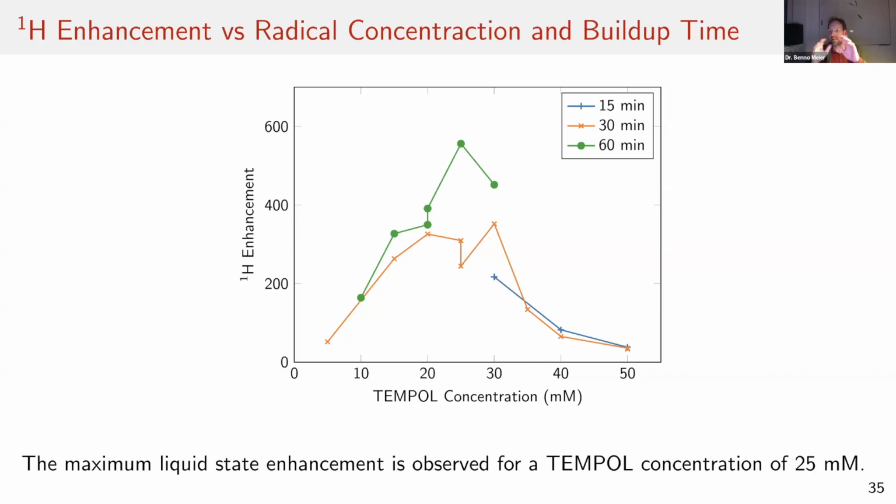We now believe that the acetate likes to aggregate in the sample, so it doesn't distribute evenly. That was a process of analyzing the data and then thinking of something else. In hindsight, it has taken a few months at least to come up with a good sample formulation.